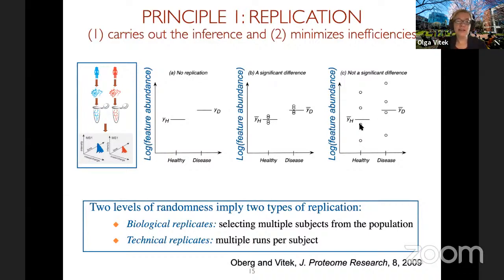So two things to say. One is just comparing these two figures, I hope you can see that fold change alone makes no sense whatsoever, right? Because the same fold change may or may not be an artifact of random variation, or may or may not be systematic. So we clearly need the signal to noise ratio and not just the signal to claim what is systematic.